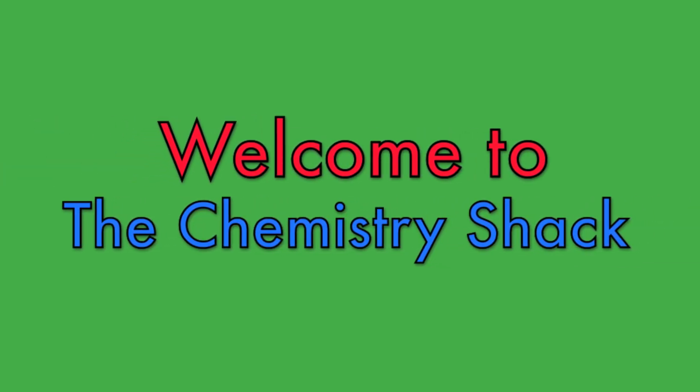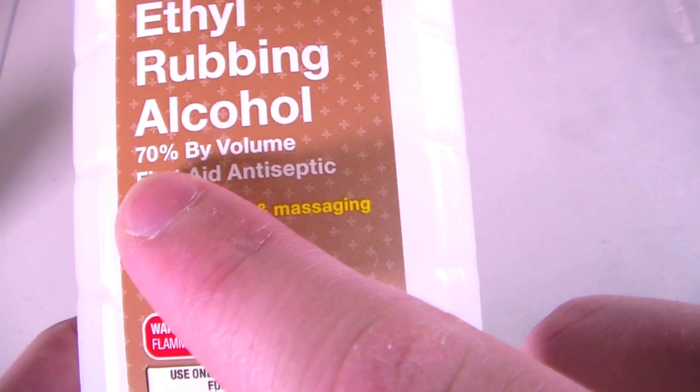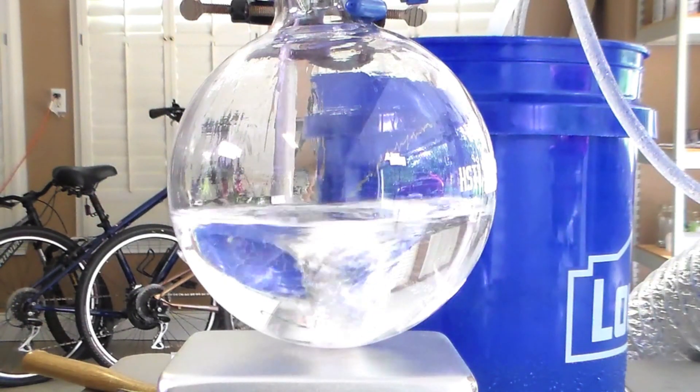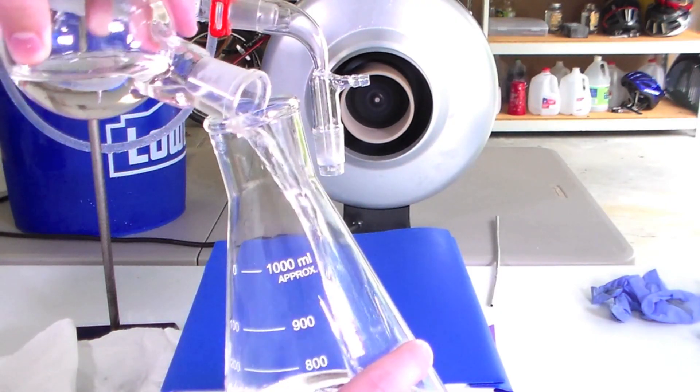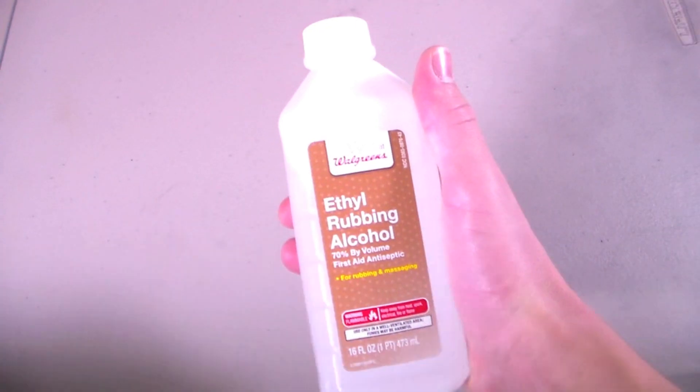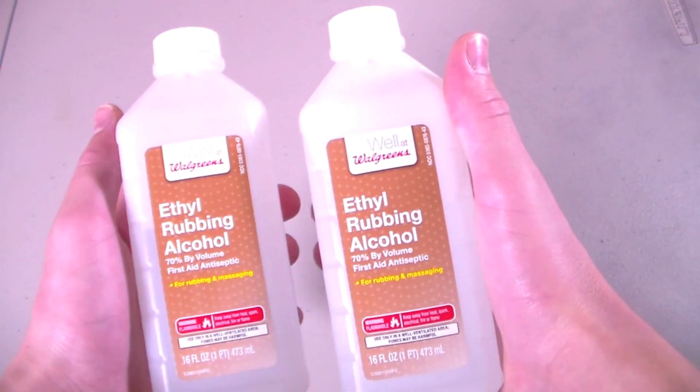Hey guys and welcome to the Chemistry Shack. In this video we will purify 70% ethyl rubbing alcohol to obtain nearly pure and nearly anhydrous ethanol. 70% ethyl rubbing alcohol can be purchased from most pharmacies or supermarkets.